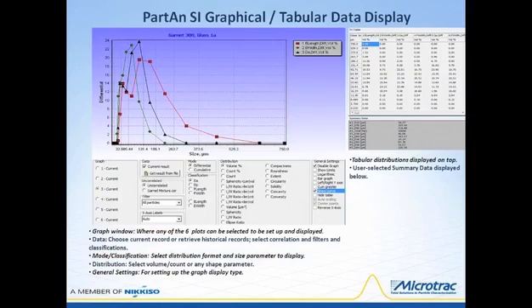The 3 windows shown above are all contained in the SI's XY display window. The XY graph in the upper left is where up to 6 different size parameter distributions can be displayed. Here we're showing the length, width, and area equivalent diameter, volume percent log distributions for a garnet sample. Any 6 of the 27 parameters can be plotted and listed in the table to the right. Also, up to 6 different historical records for one parameter can be overlaid here for comparison purposes.